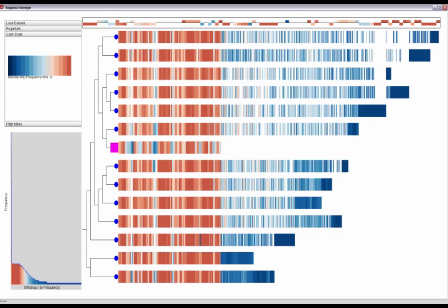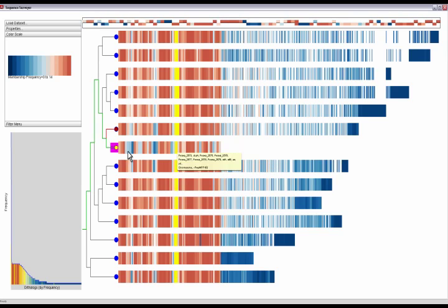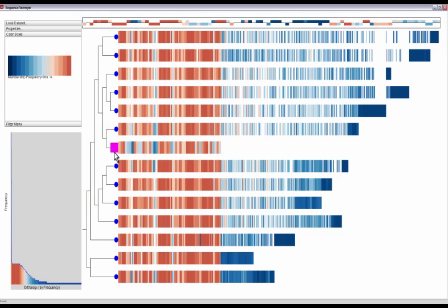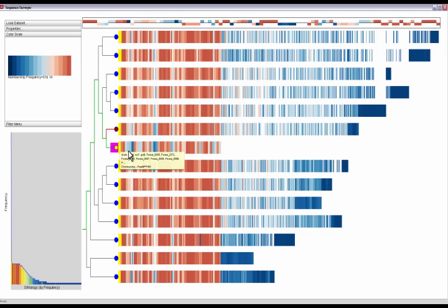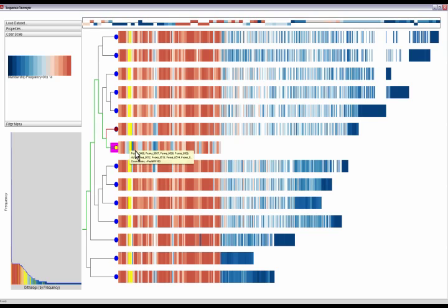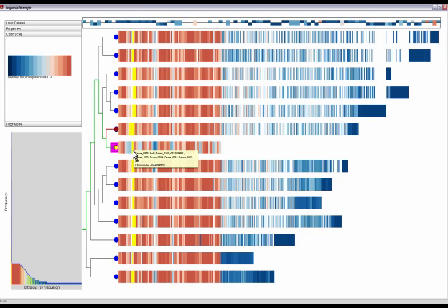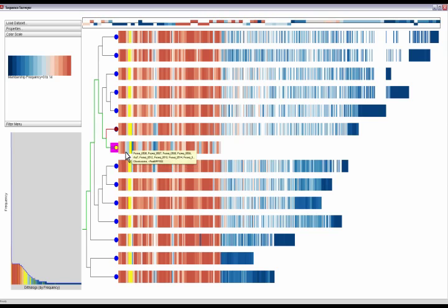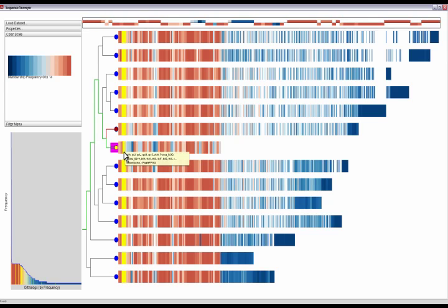Here, we again reorder the genes, this time based on their position in a selected reference genome, indicated by the pink box. This allows for a quick comparison with the reference, highlighting both unique features colored in blue and more common features colored in red.